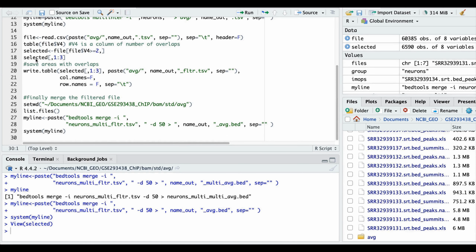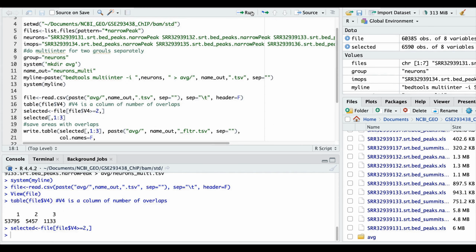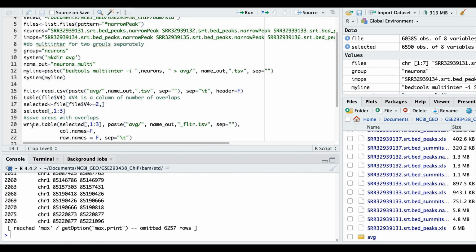What you have to select is the first 3 columns, 1, 2, and 3, so chromosome, start and end. The rest is not relevant for a bed file, neither for visualization. Select, and then write the truncated filtered table back to the file called filtered.